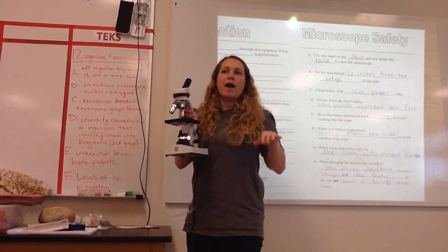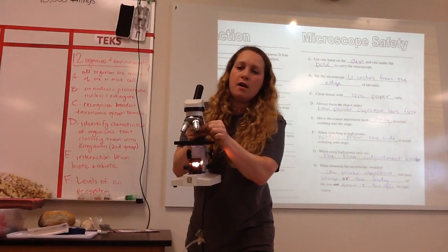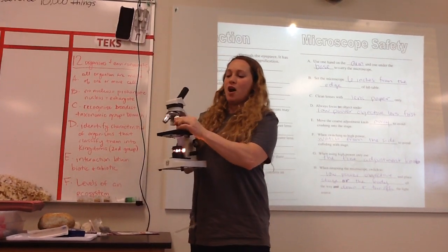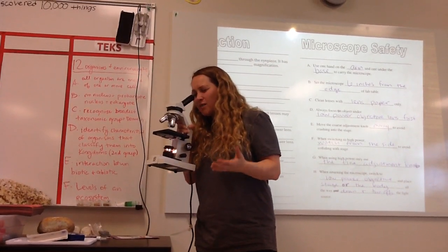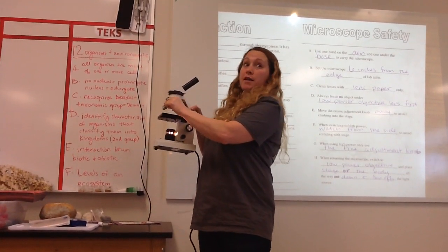So I want everyone to be quiet so maybe, just maybe, the video can hear the click. Okay, are you ready? Real quiet. Can you hear it? Okay, if you don't hear that click, that means that it's not set on either one. Then when you go to look, you'll see blackness because the light can't pass through. So if you ever look in and you can't see, something is blocking it. This is one of the things it could be.